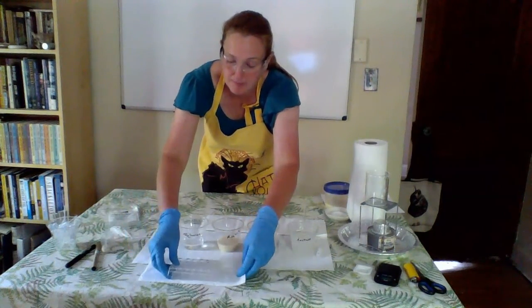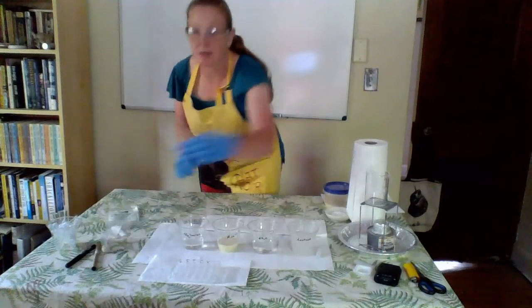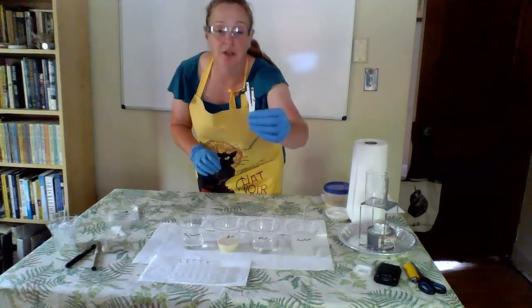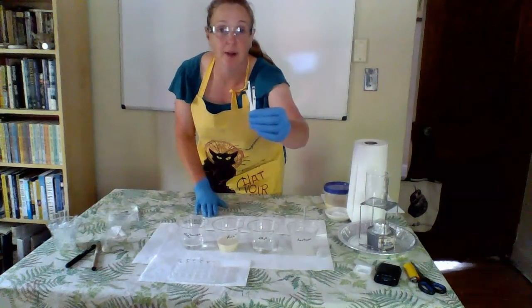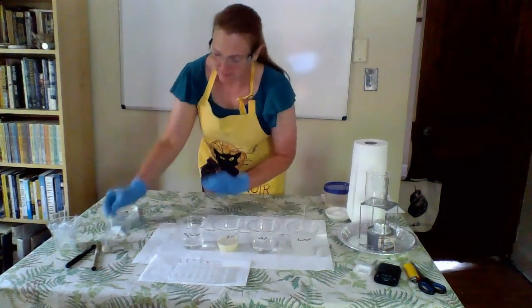This is going to make it a little bit easier for me to keep track of when I am doing my experiment. The other thing that I did was I grabbed my little glucose strips and I labeled those A, B, C, D, and E. But make sure that you do not label on the green part. We're going to need the green part. That's the part we need to change color.